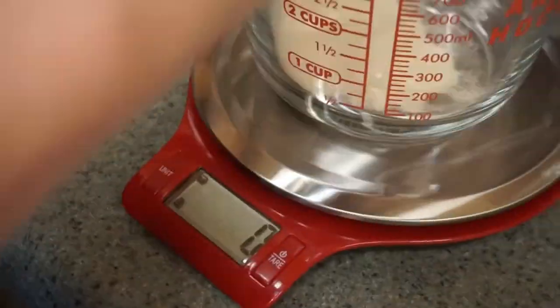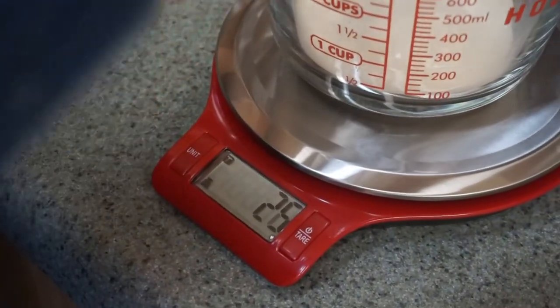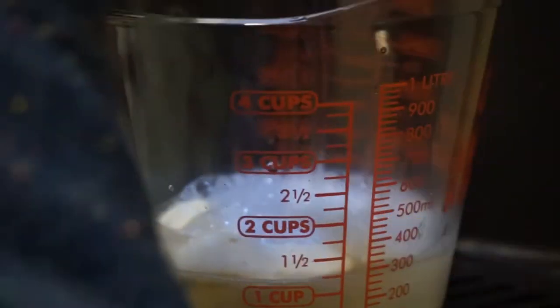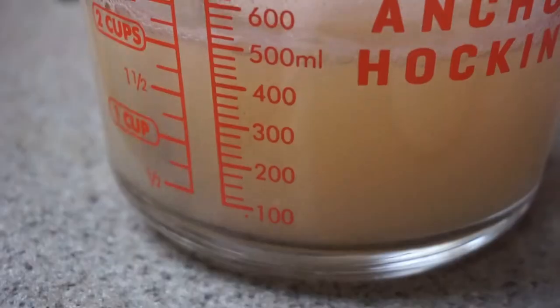Next, measure out 25 grams of agar media with a digital scale. Mix into 500 milliliters of warm water into an easy pour measuring cup, ensuring all the agar has dissolved.